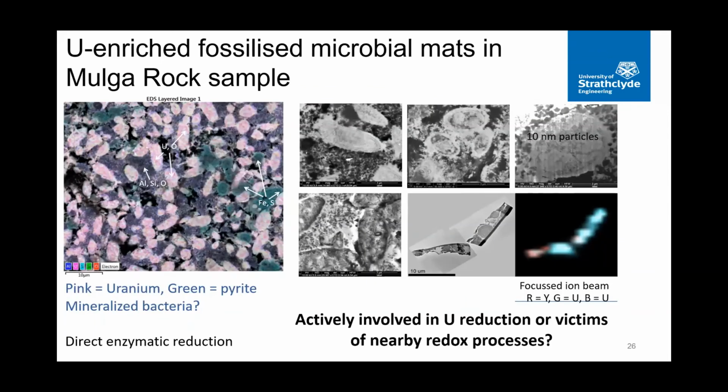So back to the lignite sample that just kept giving. One of the most striking features that we first saw at the surface was this vast expanse of uranium-dense ellipsoids, randomly orientated. This is an SEM map image, showing them in the matrix.